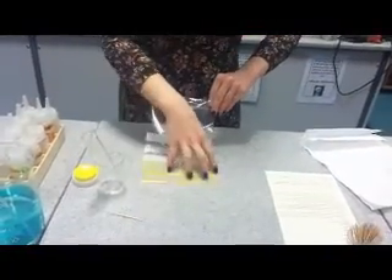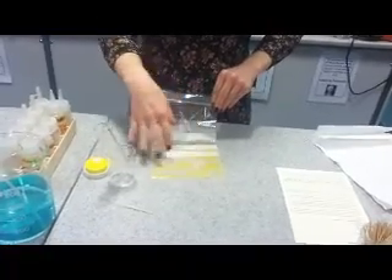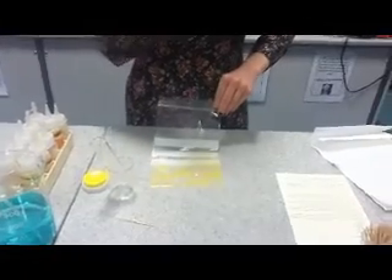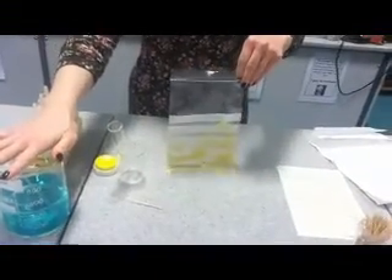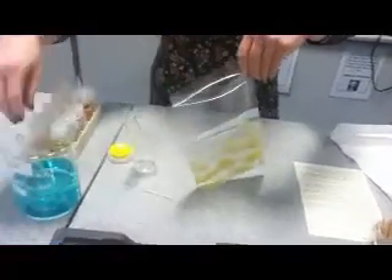We've got lots of nuclei floating around now because they've all come out of the cells — we've broken the cell walls. The nucleus — did you know it's surrounded by a membrane to keep all the DNA inside it? So the washing up liquid — what do you think that's doing to the nucleus membrane if we add it? It's going to break down the nuclear membrane.